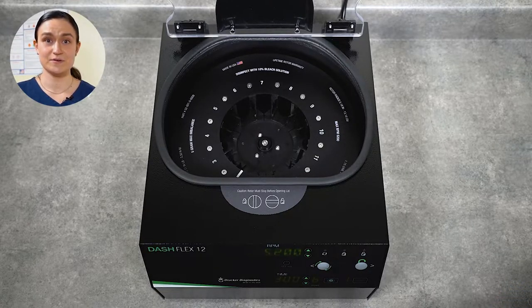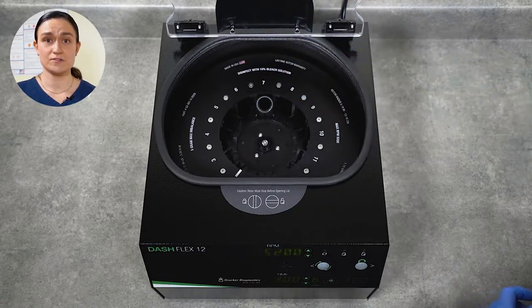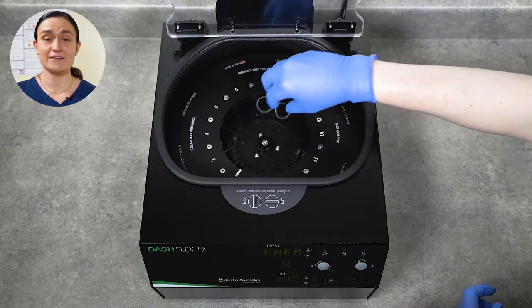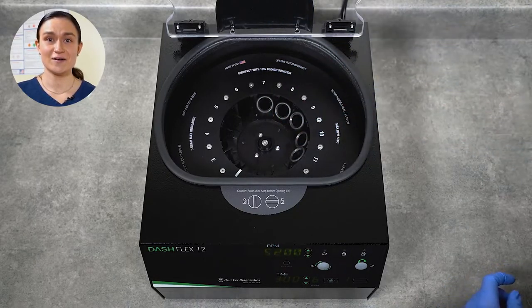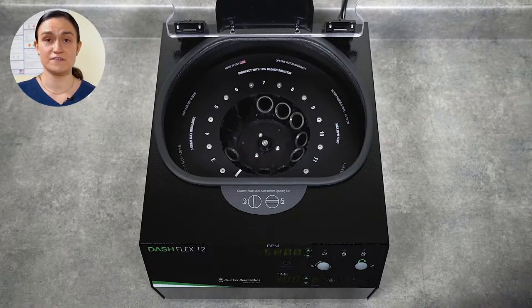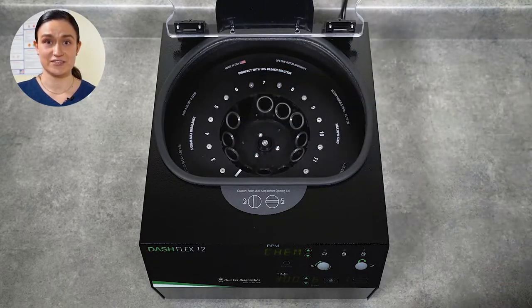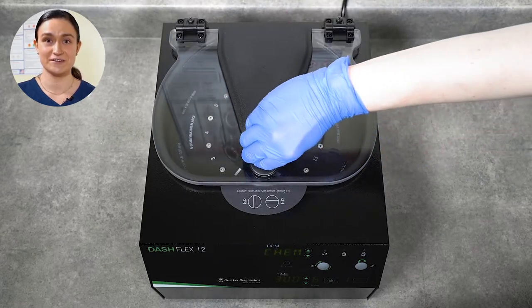We will need to put our tube holders in before we can run our first spin. Simply settle each tube holder gently into the rotor. The tube holders, when placed in, will be at a 45-degree angle, but once the centrifuge runs they will lift up into a nice horizontal spin. You will want to make sure you always place all 12 of the tube holders in your Dash Flex 12. Once your tube holders are in, your centrifuge is ready to go and you can run your first load of tubes.